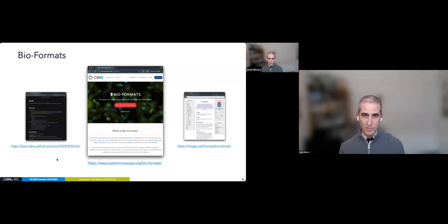And so that brings us to Bio-Formats, because fundamentally, we need something in our community that will, like tifffile, tie all of the different TIFF formats together, that will tie all of our formats together. So part of that can be using the libraries from companies directly. So bioio, for example, has any company that has provided an API that we can use for accessing their data, bioio will wrap it. And then for everything else where the company hasn't provided us a library, it defers to Bio-Formats. And so Bio-Formats becomes kind of this standard way of representing all the different file formats.